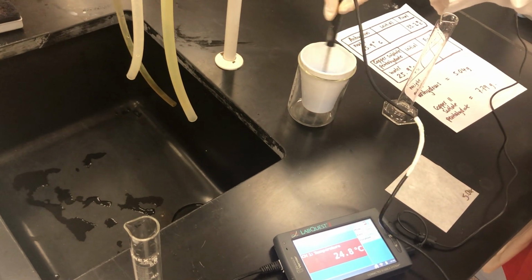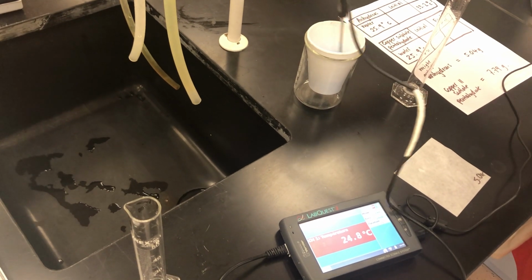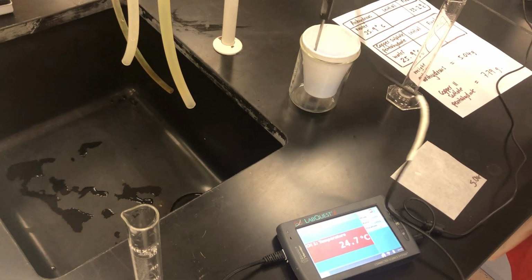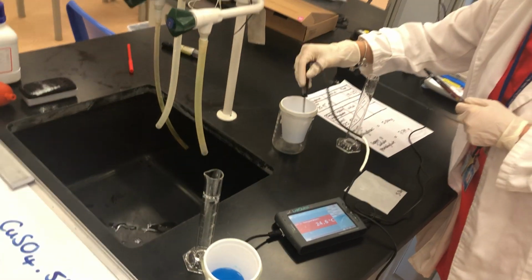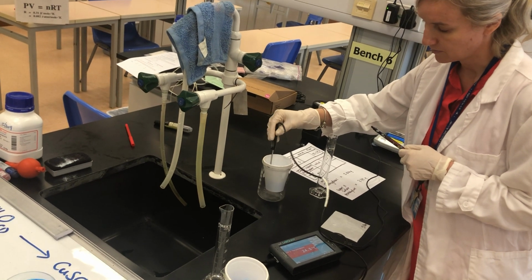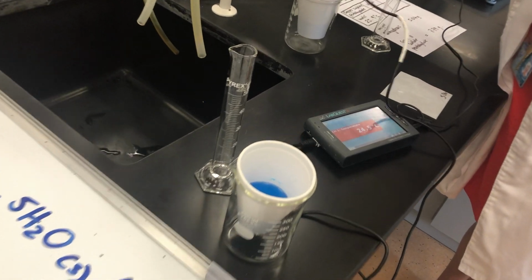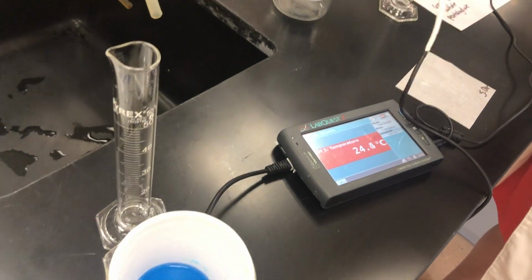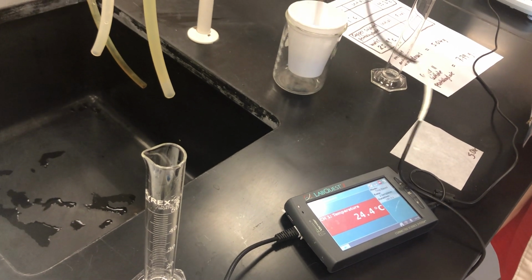Okay. So while I'm stirring this and just waiting for a few minutes, what is your most important message for those students that are going to take AP Chemistry next year about bond breaking and bond forming? Well, when you're dealing with a chemical reaction like this, both bonds are being broken and new bonds are being formed.